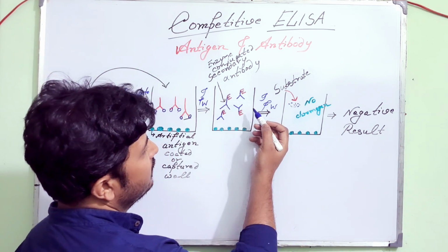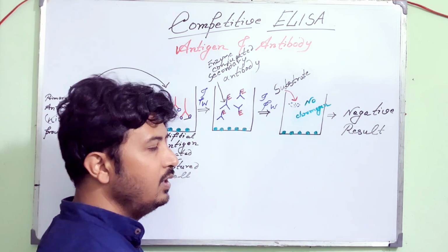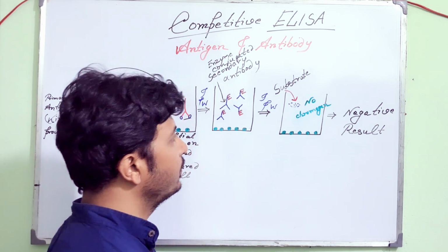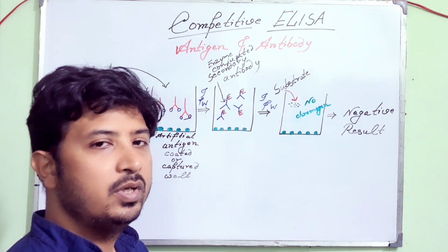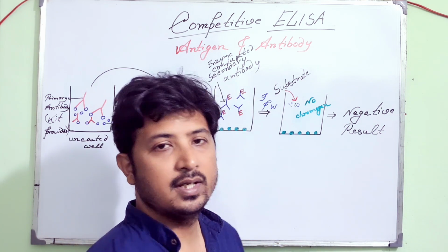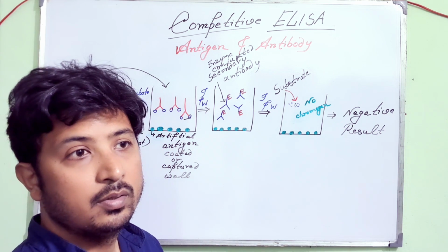After incubation you washed it off, you added substrate, and interestingly there is no chromogen formation, no color change. So you will consider your OD chart, or the recommended positive and negative controls, or the cutoff values, to consider it a negative result, because there is no chromogen formation.